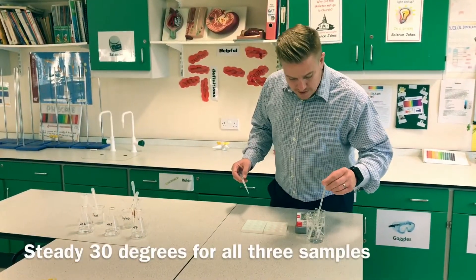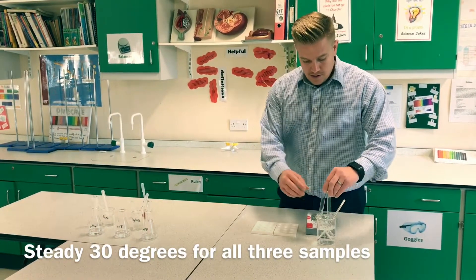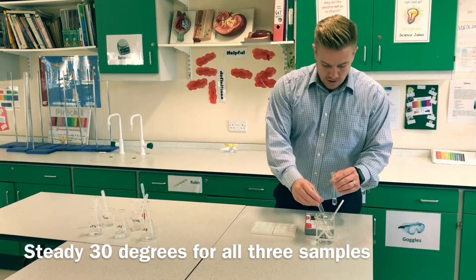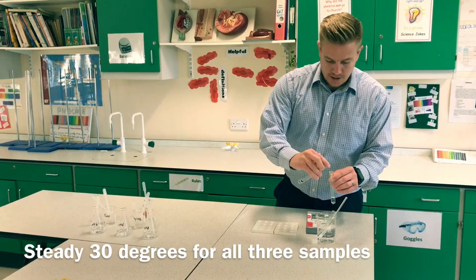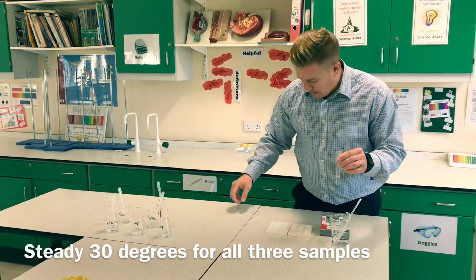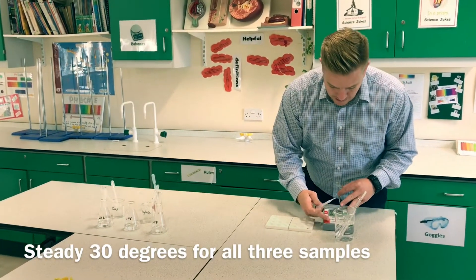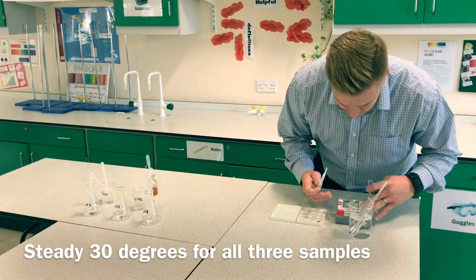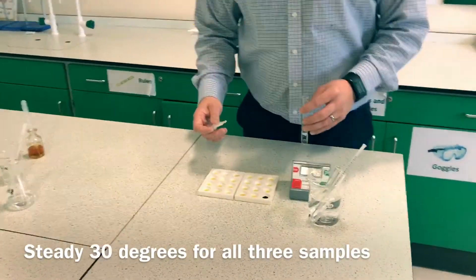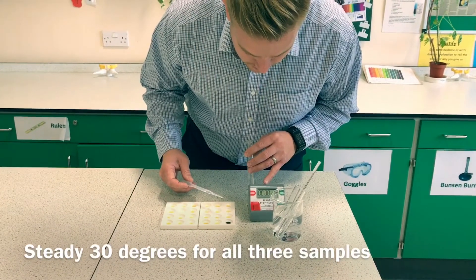Now I've got my steady 30 degrees, I'm going to mix all three together to begin the digestion process. Give them a little flick just to get started. I'm going to take one sample straight away onto my iodine and start my clock. As you can see, the iodine is showing up starch.